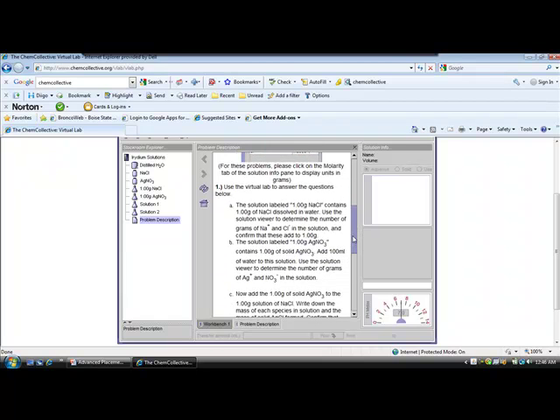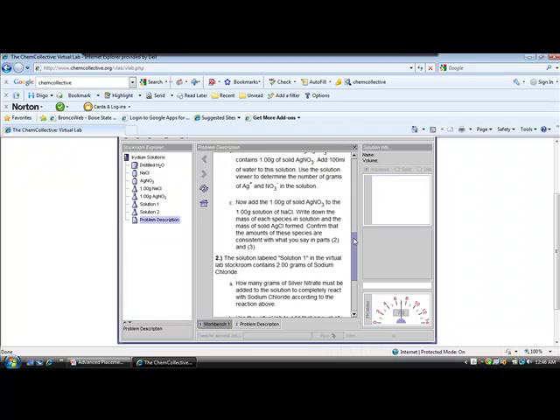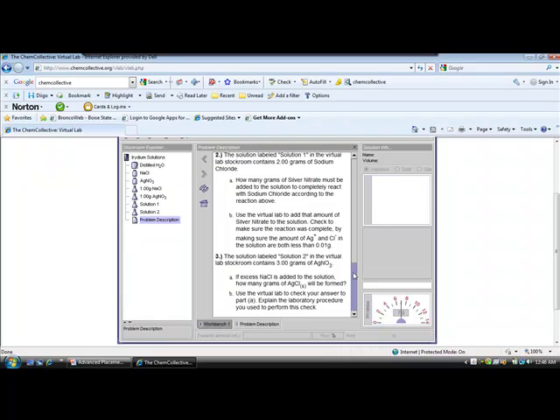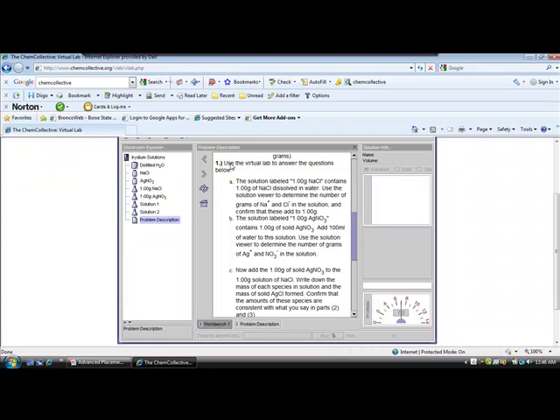And even though this looks like it might be a cookie-cutter procedural type, it's pretty open-ended in the way the format is, and it's good like that because it has you being the investigator. I'll show you how to drag the solution out momentarily. Let's look at number 1, A, B, and C here. In this particular one, it has 3 procedures that you're being asked to perform today. As we go back up here, we're going to use procedure 1A, B, and C as an introduction to how to use this lab bench.